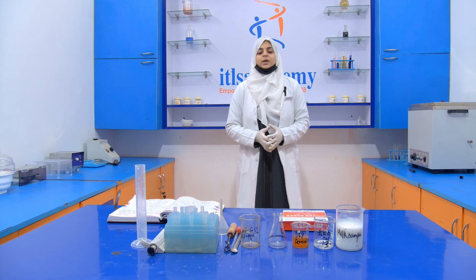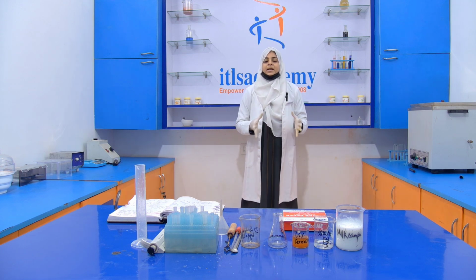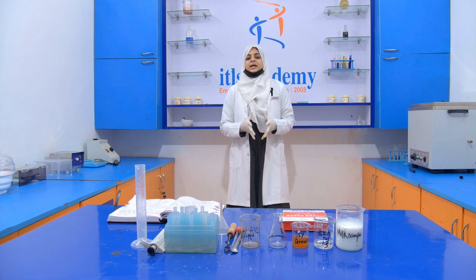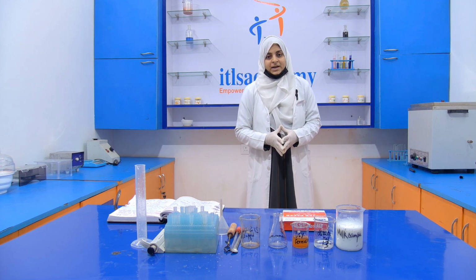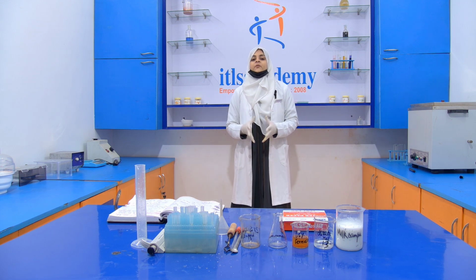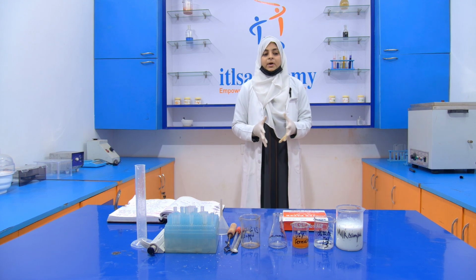Today we are going to discuss another experiment in the preservative series, that is the detection of benzoic acid and benzoate, and along with it we are also going to detect salicylic acid. Here, what are preservatives?